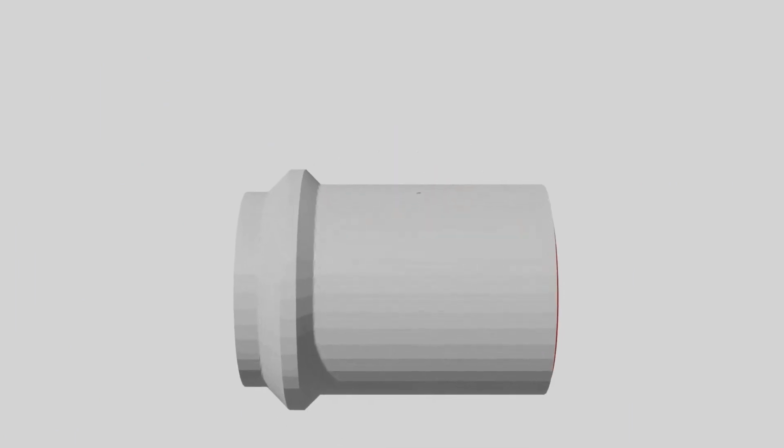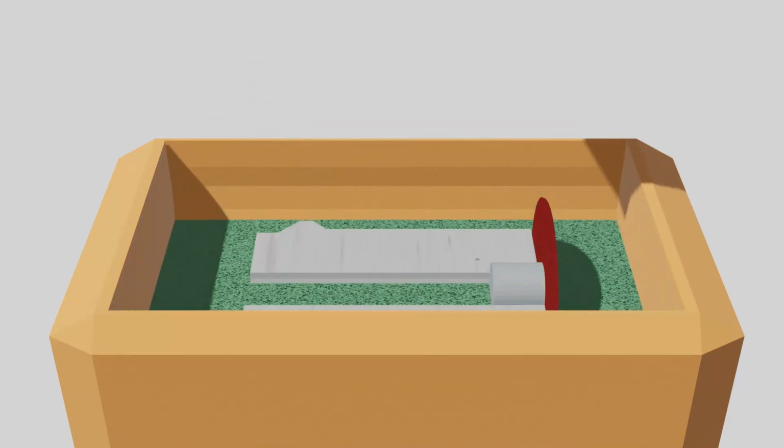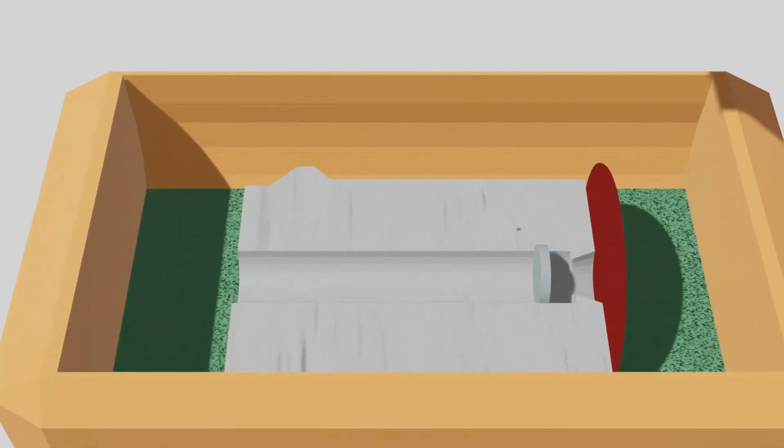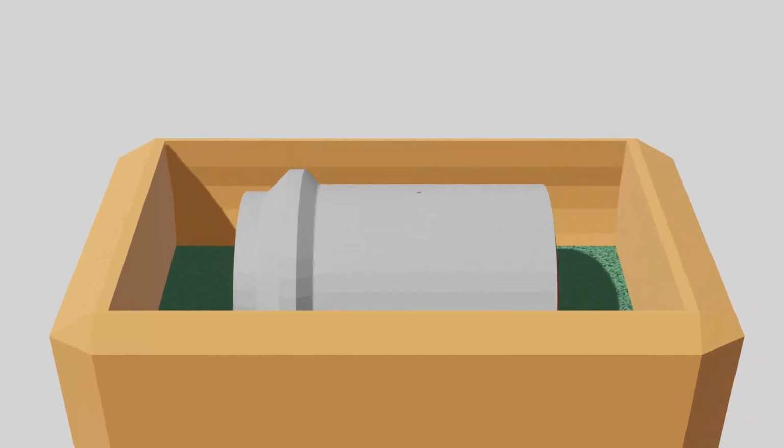Next, once our cells have reached full confluency and have formed a monolayer, we will gently place our device sideways into an enzymatic bath of collagenase for 1 hour. This step fully removes the gelatin plug that was placed within the tube and creates a free-floating monolayer across the 1.75 millimeter hole with cells attached only to the outer rim of the tube.